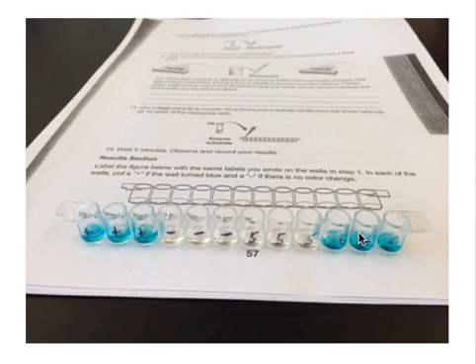So here, these were the tests, and these wells labeled 5 did not change color, and the wells labeled 6 did change color. So by comparing them to the control, we can see that the wells labeled 5 did not contain an antigen, and these wells did.